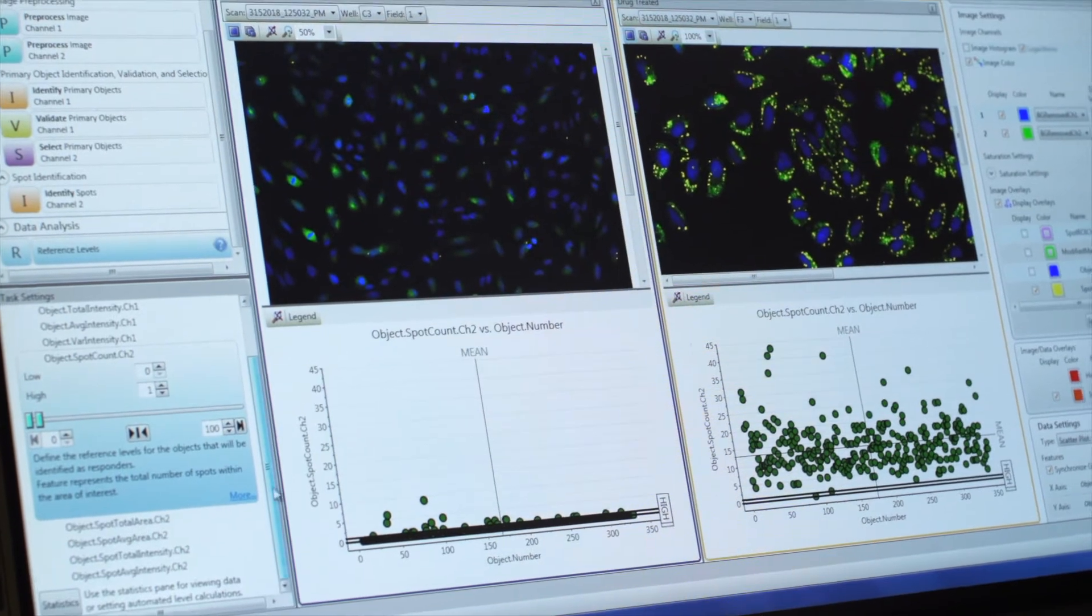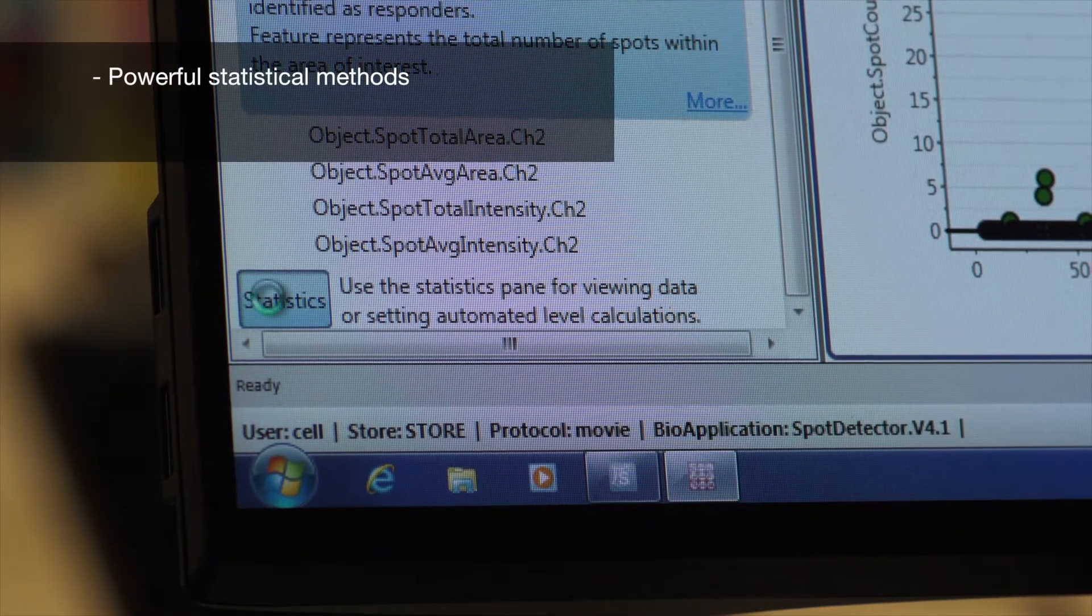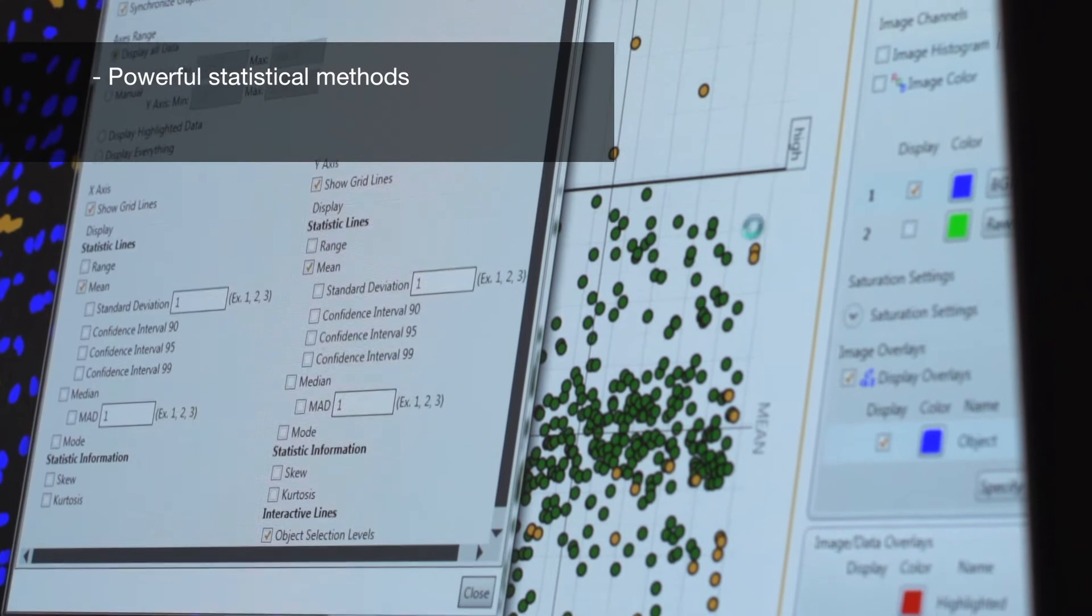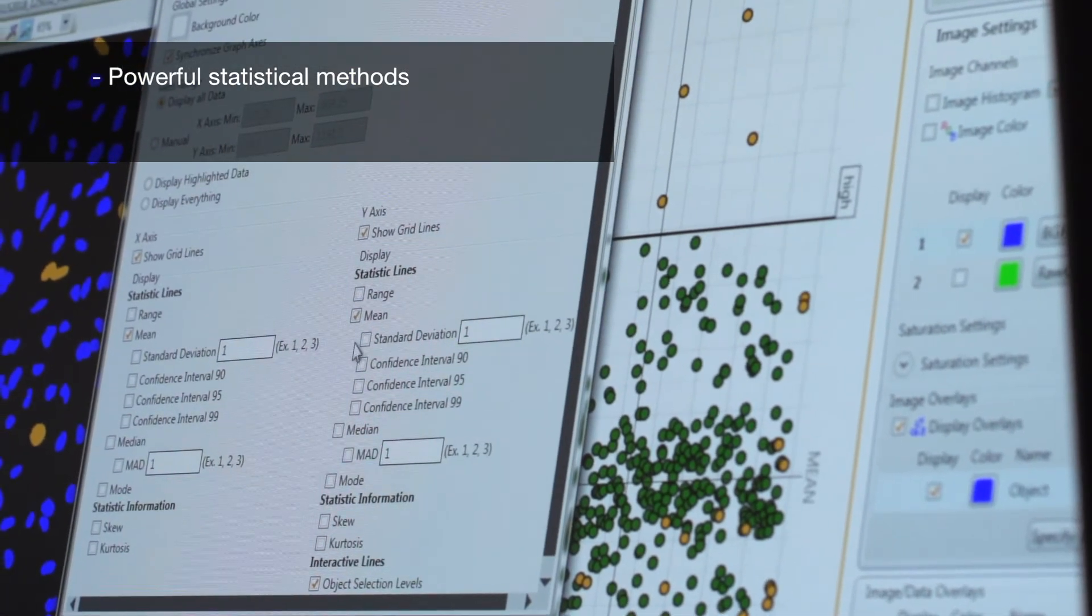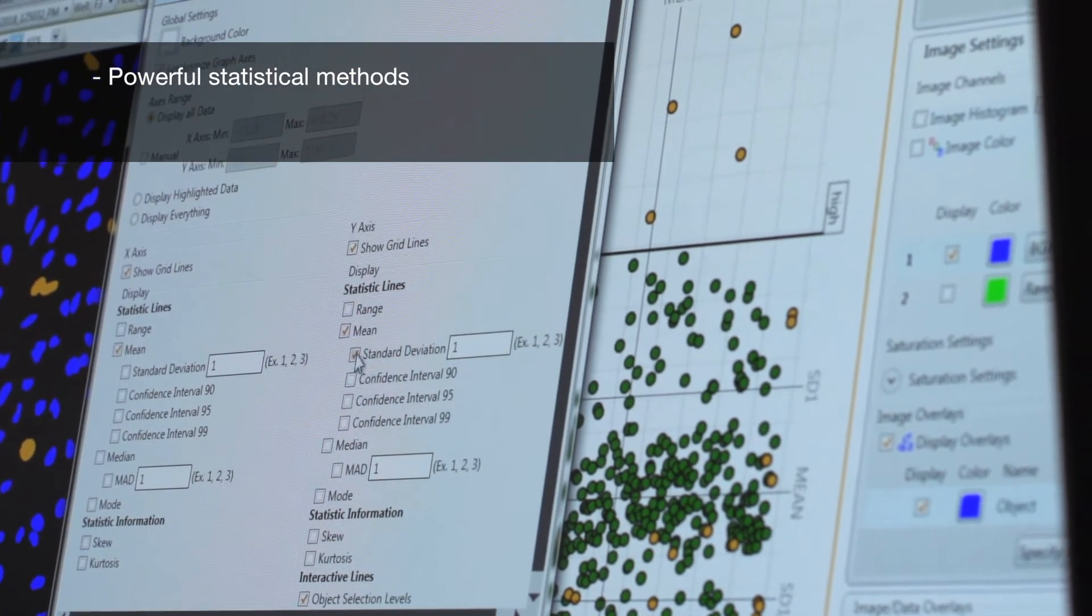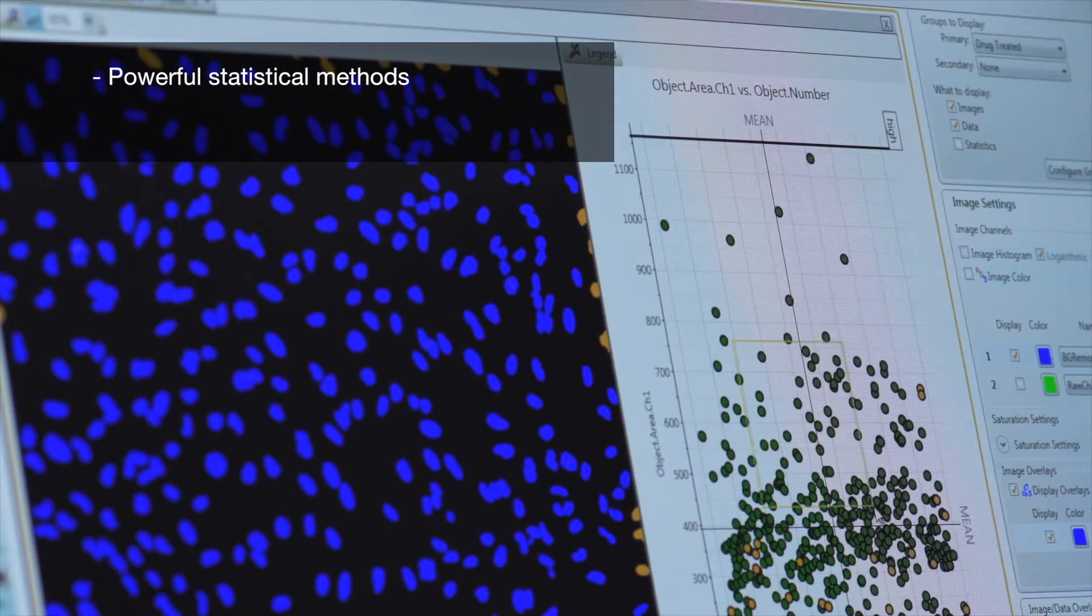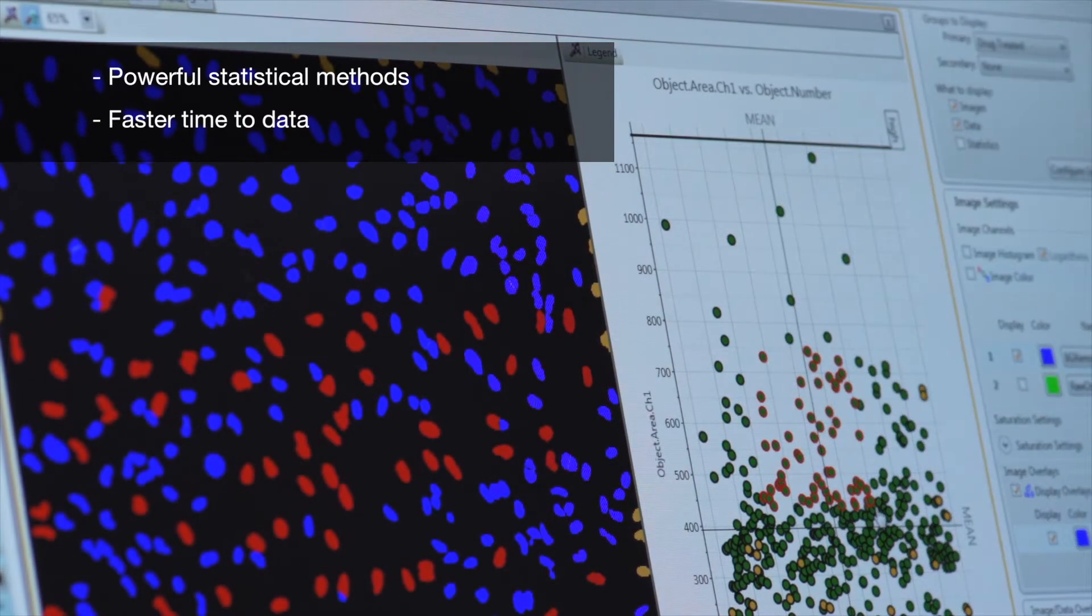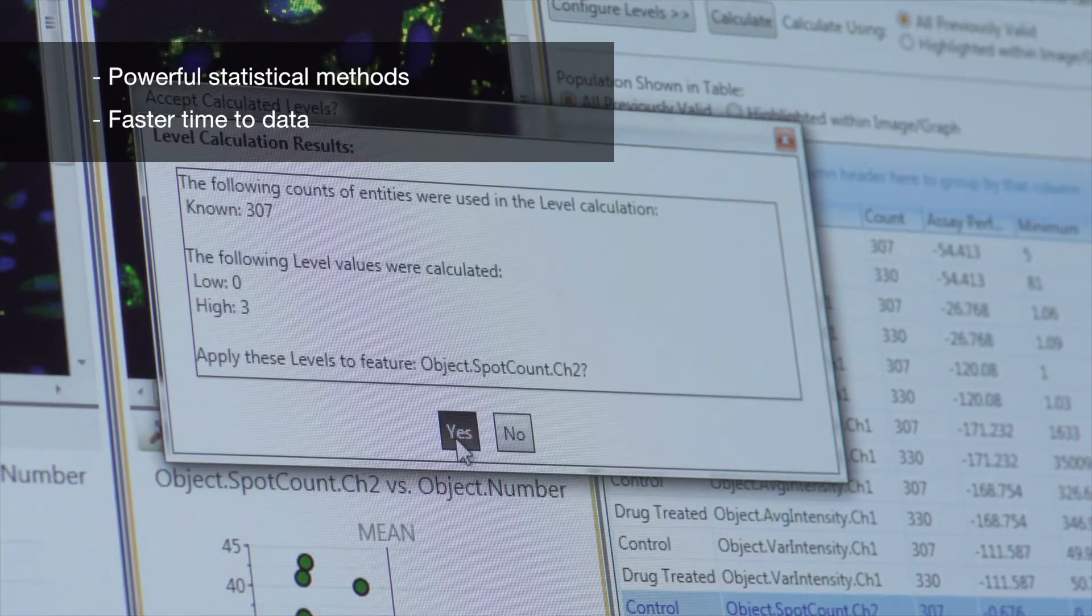Our HCS Studio Cell Analysis software has powerful built-in statistical methods which allow you to instantly make decisions. Did your assay work? You don't have to wait for hours to find out. The results are only a few minutes away.